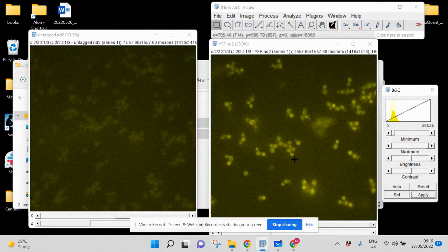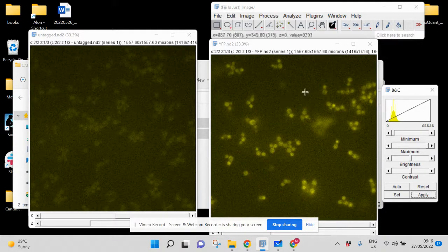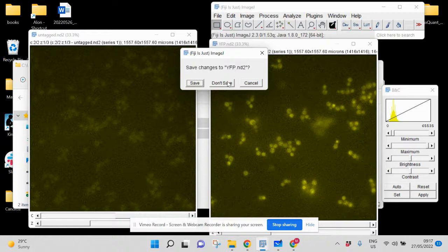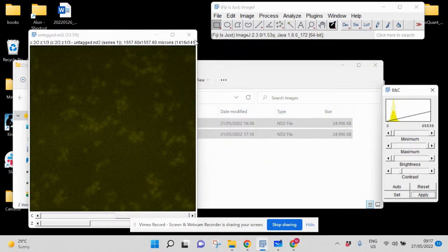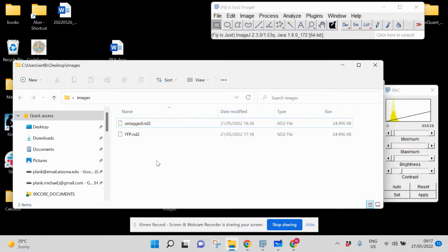If you save images after hitting Apply without having set the same min and max for both, you'll have a problem because the same intensity values would represent different underlying data. I don't think it's good practice to overwrite your original images. When you close, ImageJ will ask if you want to save changes, because now there are actual pixel value changes — not just display changes. I would not recommend saving in that case. You could save a copy, but only if you're certain the changes applied are correct. That's essentially the background on setting brightness for comparable microscopy figures.